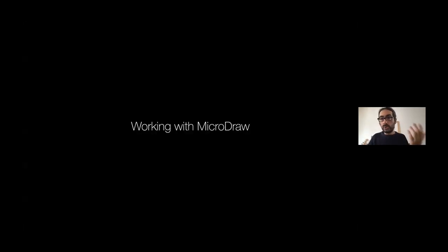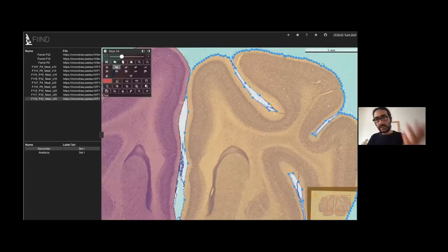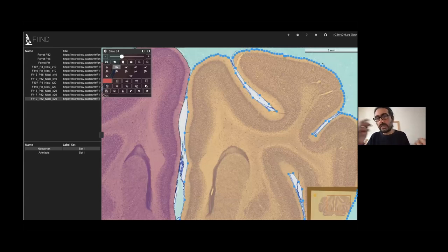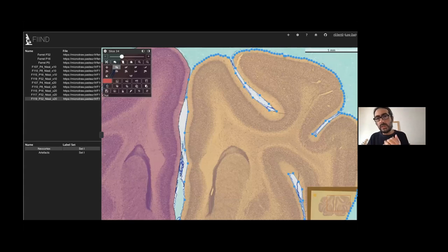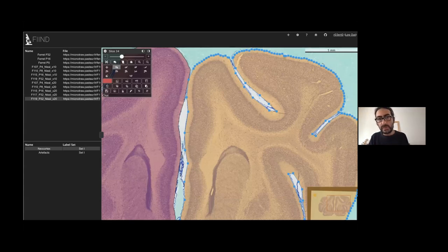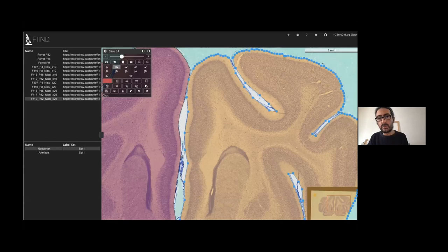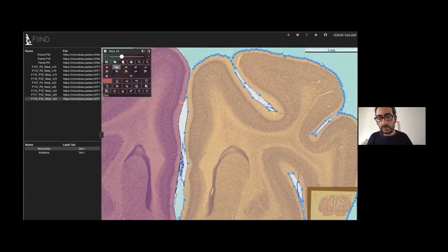How do you actually work with MicroDraw? This is one example from our work with the ferrets. So you start by segmenting the structure that you are interested in. We're interested in the relationship between the development of the neocortex and the development of brain folding. So we start by segmenting the neocortex. As you can see here, we have two hemispheres in this example.